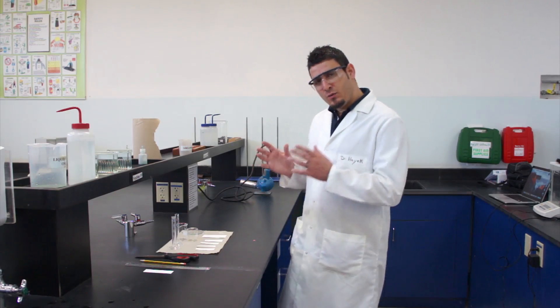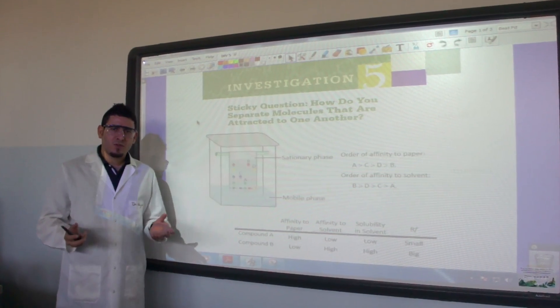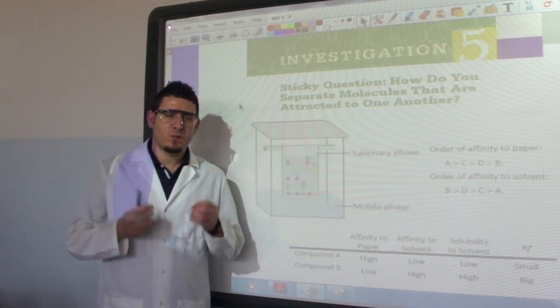In this video I'm going to show you how you can separate the components of a mixture of different compounds using chromatography paper. Let's discuss the theory and the objective of this experiment, and then we will come back and I'll show you the details on the experimental procedure. Chromatography is one of the separation techniques that we can use to separate mixture components from each other.